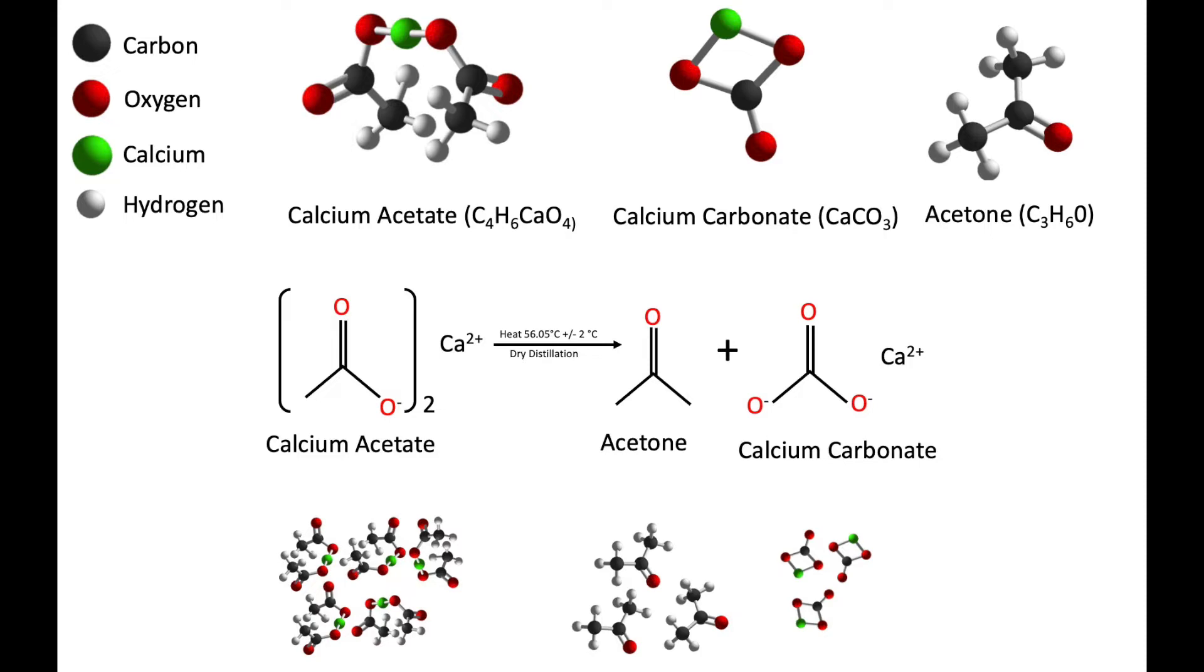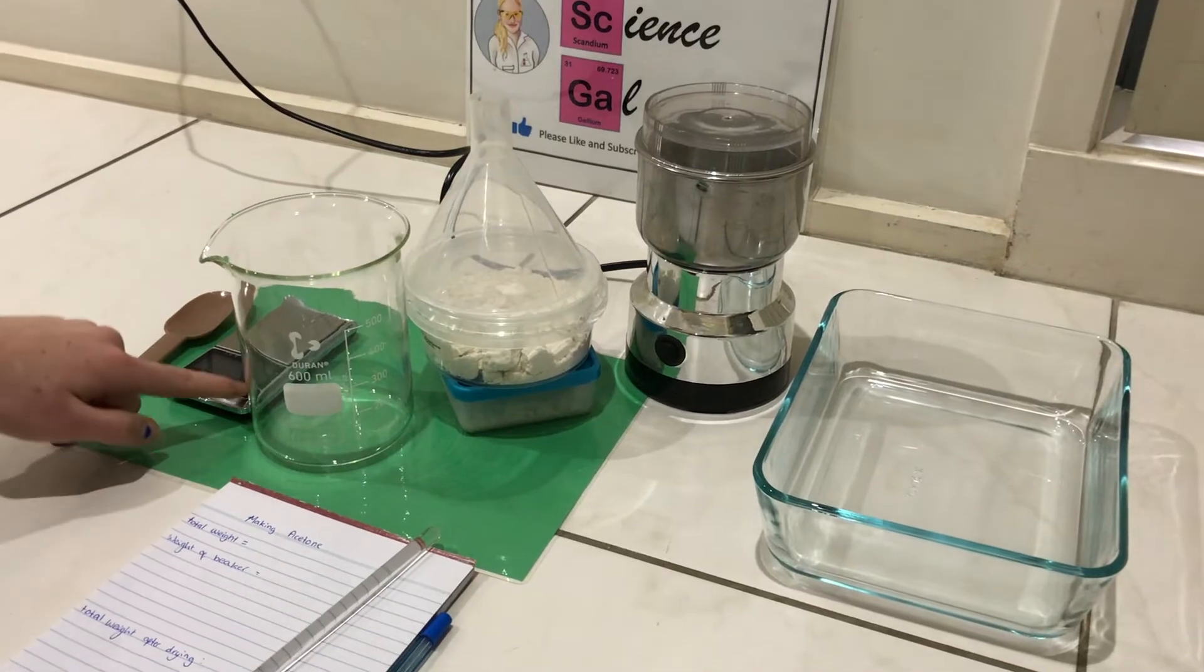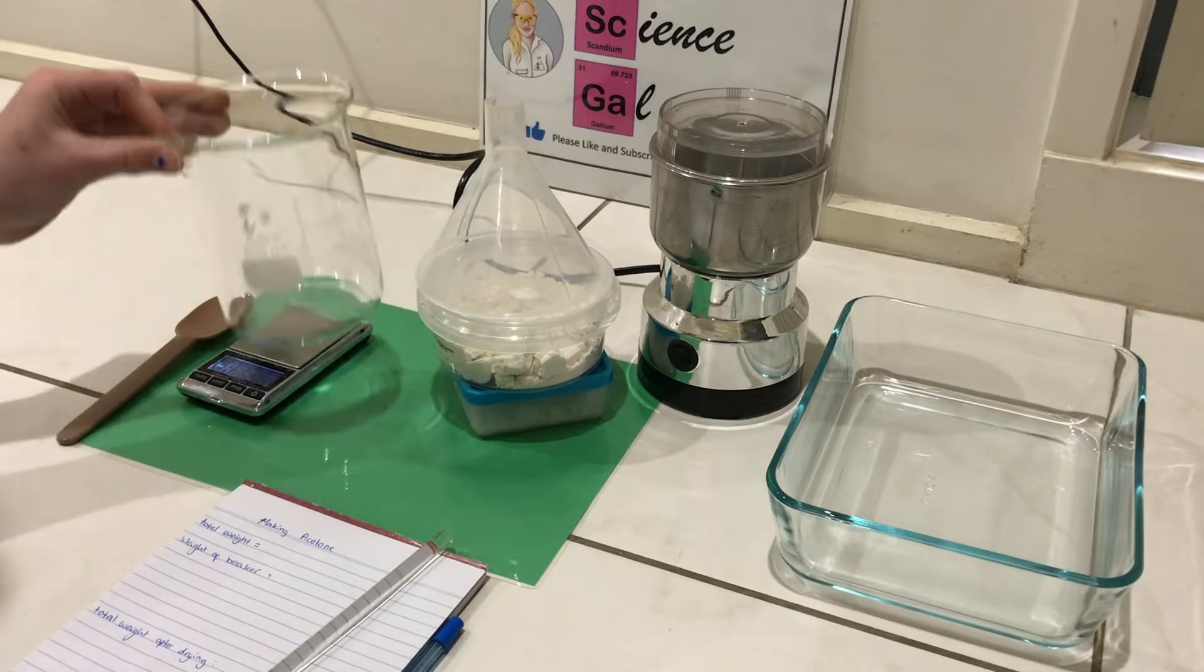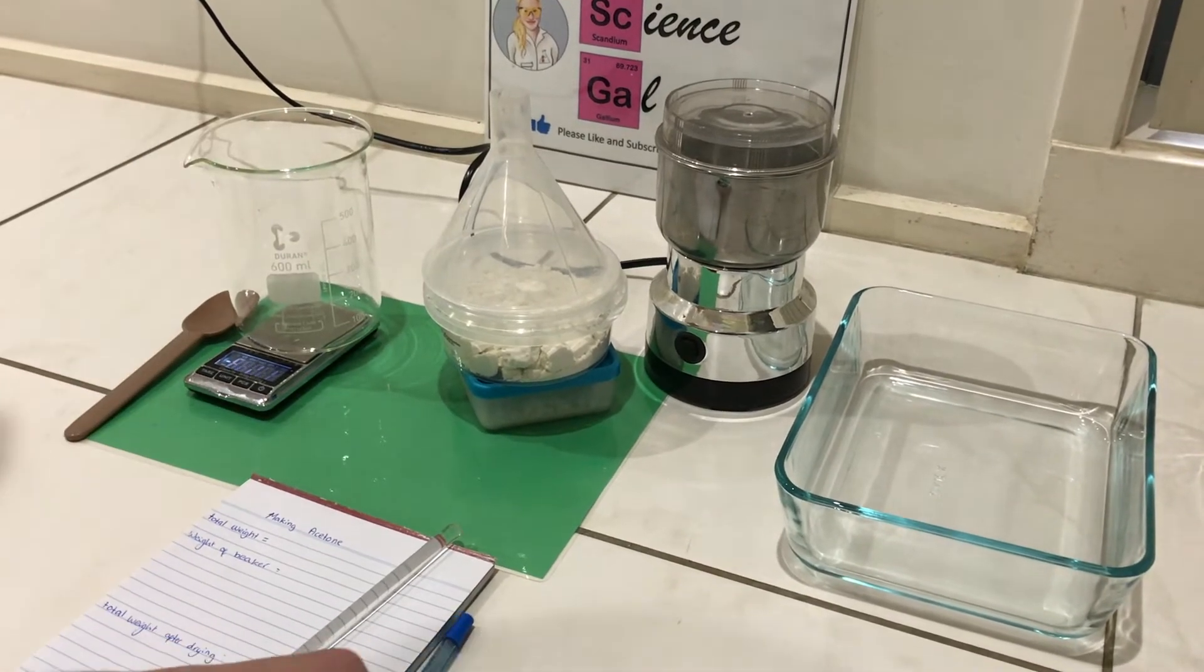Now what are we waiting for? Let's get into it. I'm ready to weigh the calcium acetate, so I know how much I have. This is the calcium acetate I made in my first video.